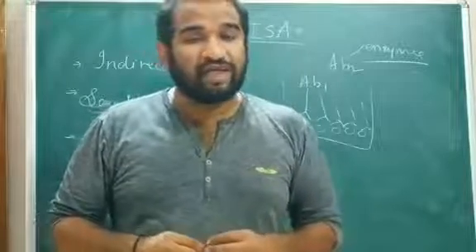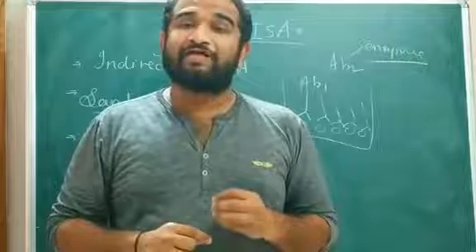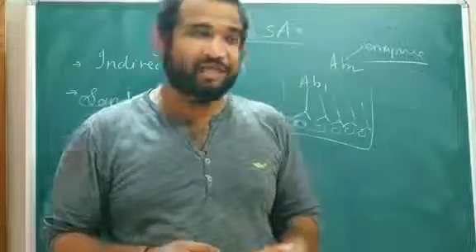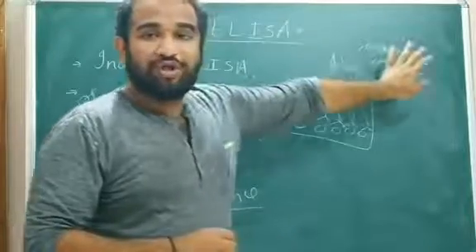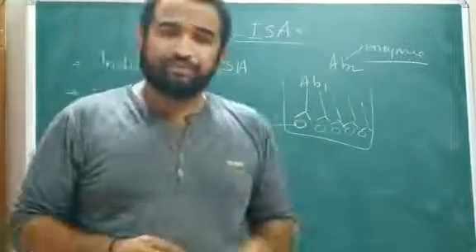Beta-galactosidase and alkaline phosphatase are enzymes derived from a bacterial source, whereas horseradish peroxidase is obtained from the horseradish, that is, the eating radish. So this antibody 2 is linked with, or conjugated with, an enzyme. This antibody is added to the microtiter well.